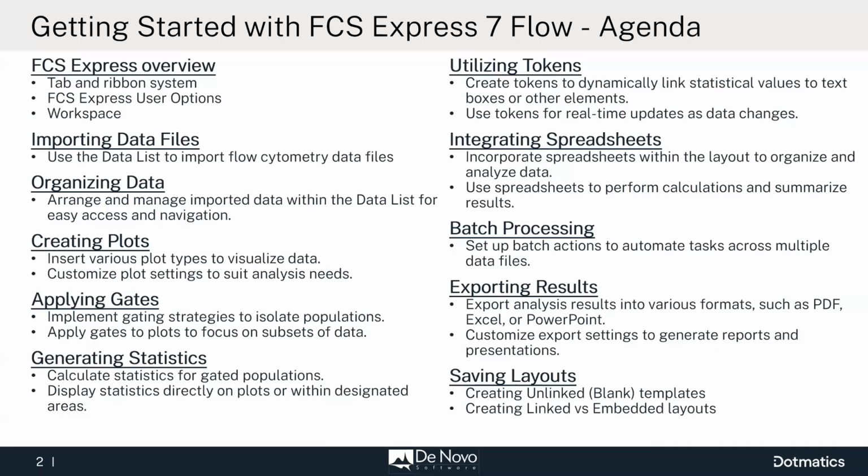We will talk about importing data files, like how to bring those raw data files from your instrument directly into the software to analyze, and then how to organize them within our data list so that they're easily accessible and that you can use them to navigate around. From there, we will be creating plots and applying gates to our data so that we can set up our gating hierarchies. And then we'll be generating statistics for all of that data and talking about the different ways that you can display that within your layout.